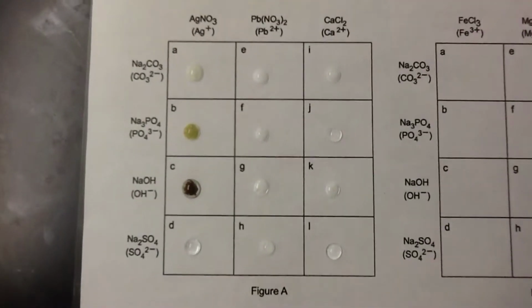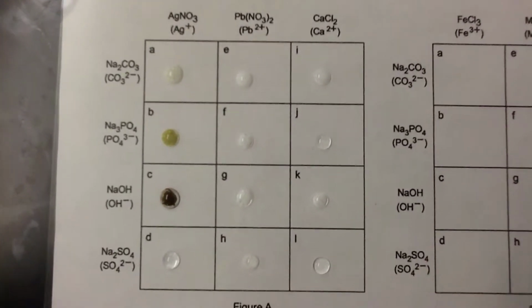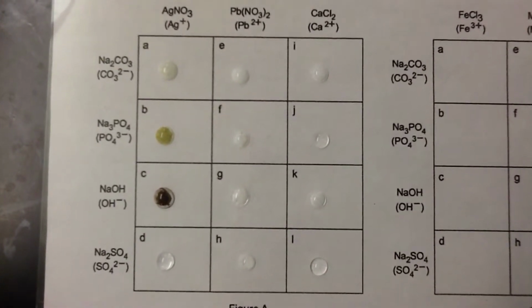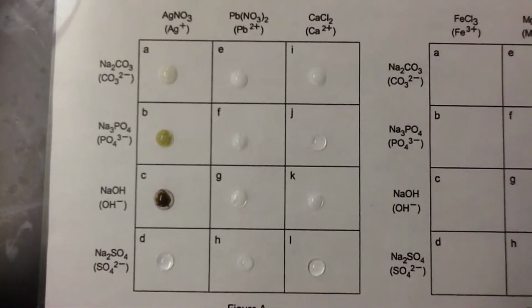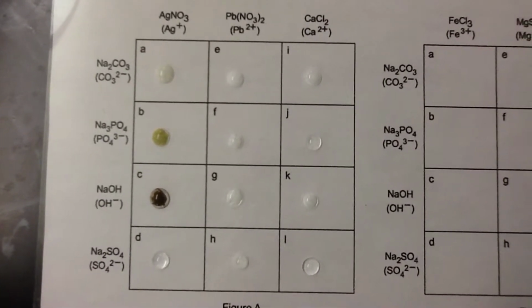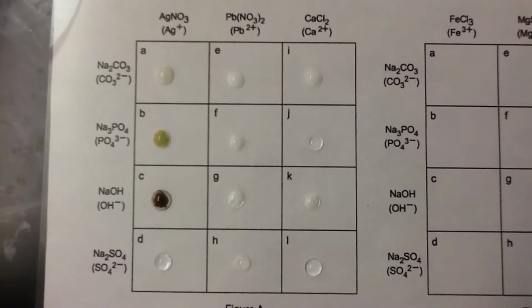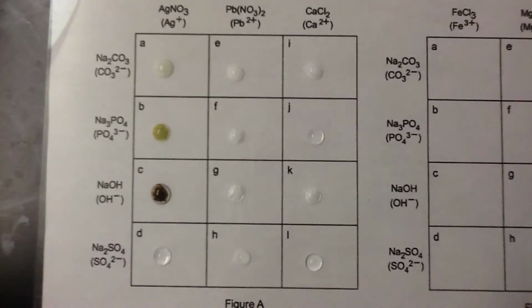When we mixed CaCl2 and Na2CO3, it turned a milky white again. And when we mixed CaCl2 and Na3PO4, it remained translucent. Then when we mixed CaCl2 and NaOH, it became milky white like the first one. And then in the last one, when we mixed CaCl2 and Na2SO4, it remained clear.